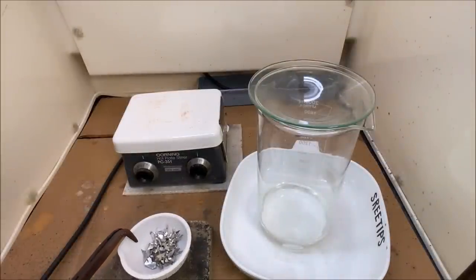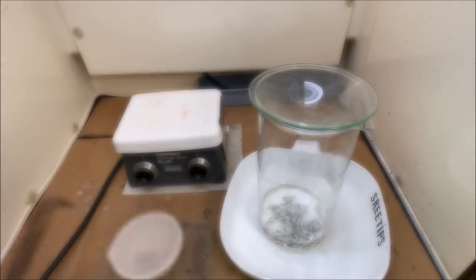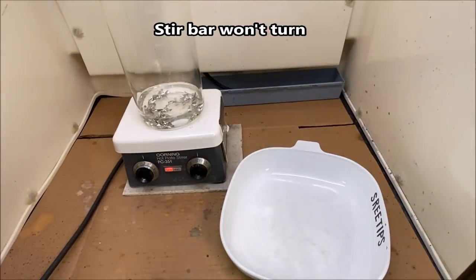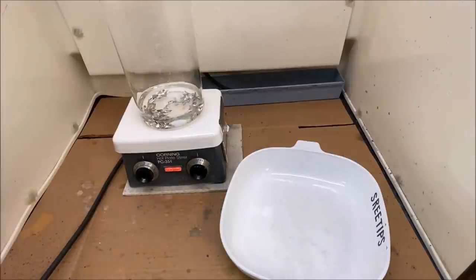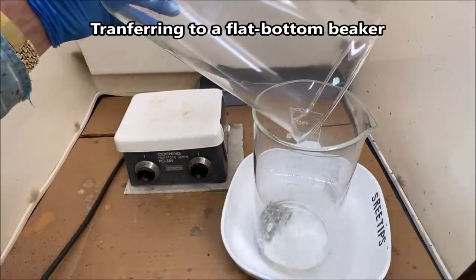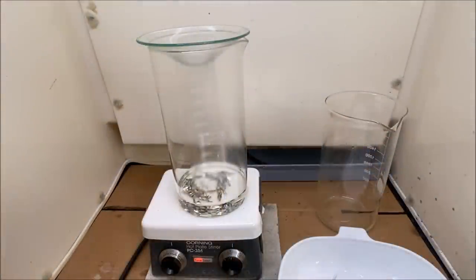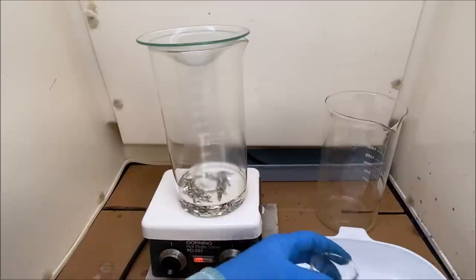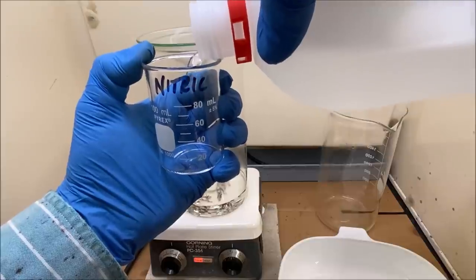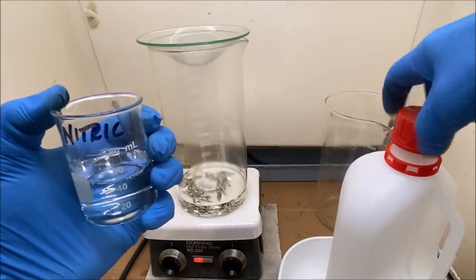Now we'll add the platinum to the beaker. Now we're going to set the beaker up here on the heat and start heating our mixture. Got our platinum up on the heater, the stir bar running. I'm going to add about 50 milliliters of nitric acid. Start dissolving the platinum.